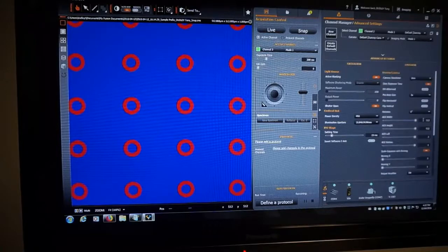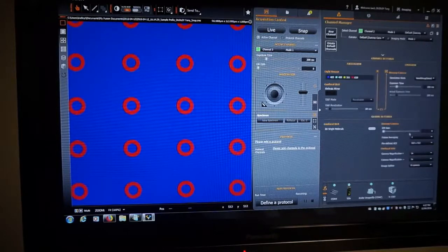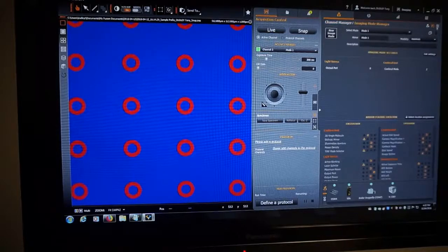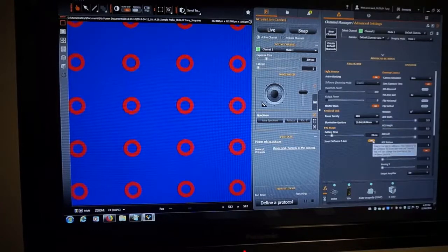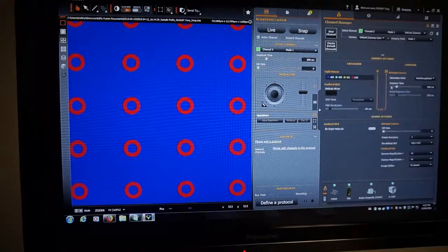And so where people get lost is usually figuring out where the hell is that parameter that I'm looking for, right? So you have to start looking here, here, is it in here, is it in here? And my response to that is, well, if you set it up initially correctly, meaning define what you want to be a channel parameter and a global parameter in the first place, then you won't have that problem each time you start and stop Fusion.